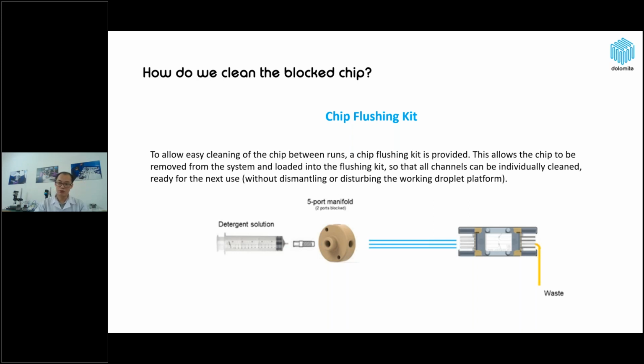So it's very useful. Normally the T connectors are just enough if we use just a 2-way input. But in case of more than 2 or 3, we need to use a 5-port manifold. Is that clear?